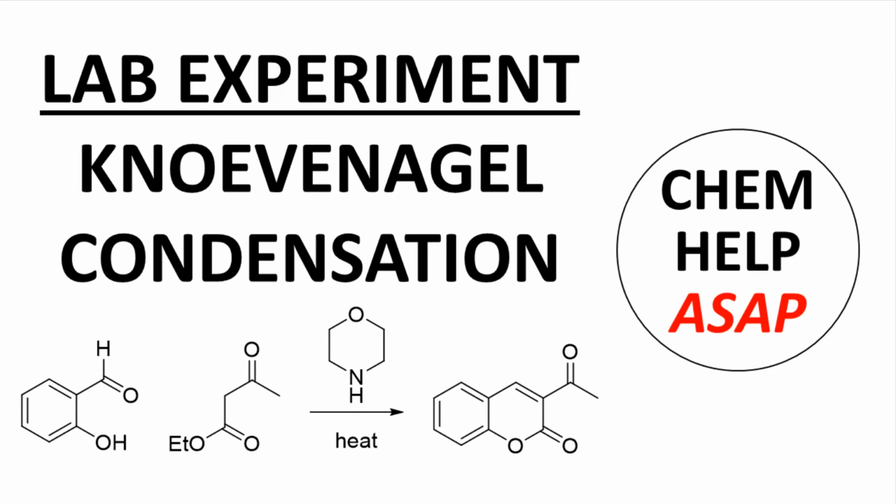In this video, we'll demonstrate the Knoevenagel condensation and prepare a substituted coumarin. We will discuss the reaction, perform the experiment, isolate the crude product, and characterize the material.